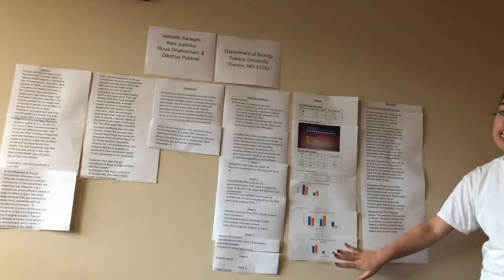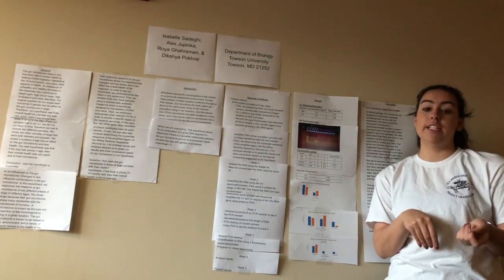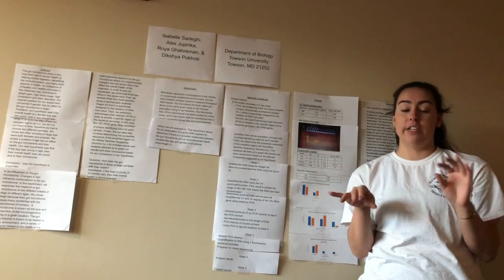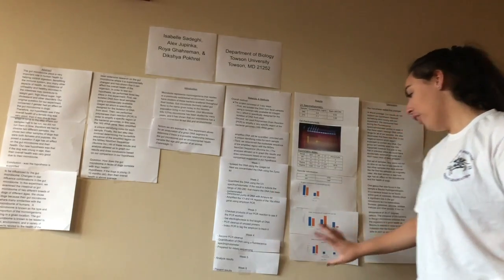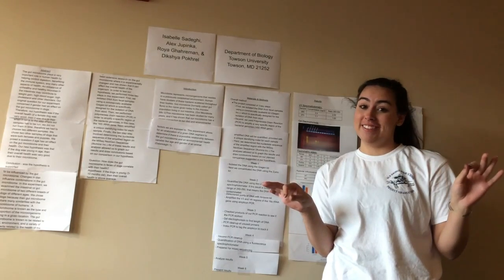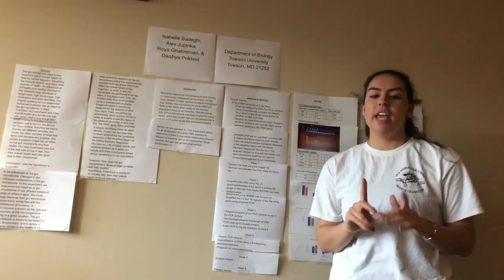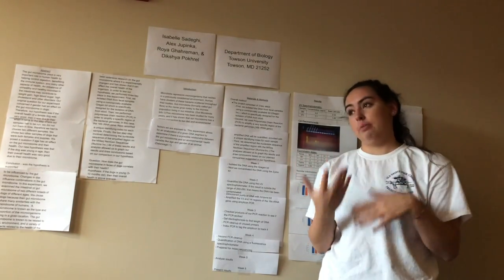We made one for kingdom, order, and genus, and we labeled the X as the organism detected and the Y as the percentage. For the kingdom, it shows the top 2 of the 8, and sample 307 had a high percentage in bacteria and a lower percentage in unclassified. For our order graph, it showed the top 3 of 8 classifications: Clostridiales, unclassified, and Bacteroidales are the classifications in that chart. Sample 343 had a higher percentage in unclassified than sample 307 had.